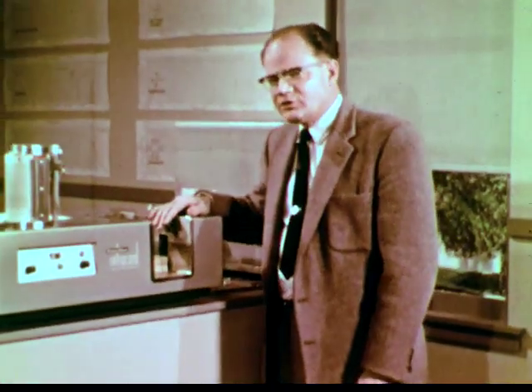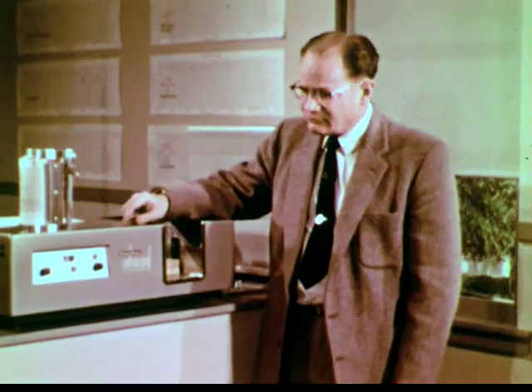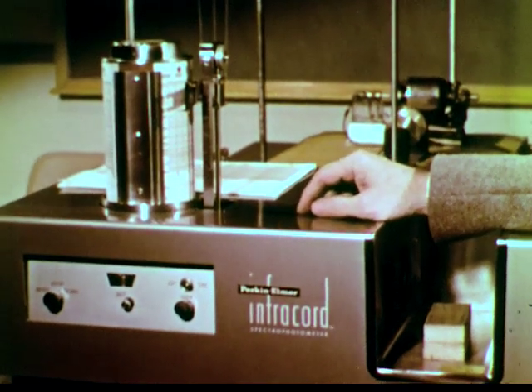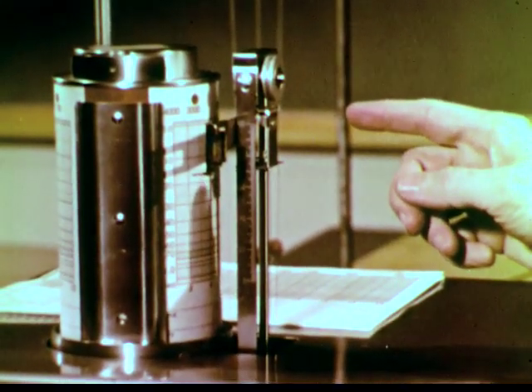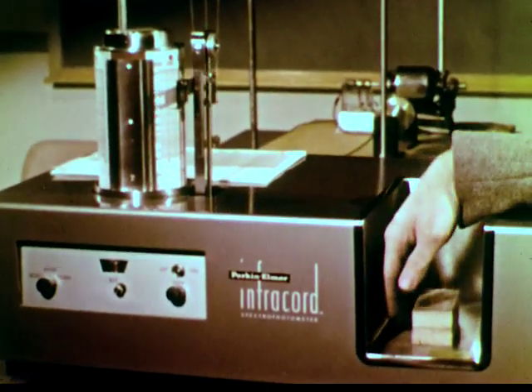Here, we have a spectrometer which scans the infrared spectrum and draws a graph of the transmission of the sample in the infrared. In this spectrometer, the instrument runs through frequencies in the infrared range, around 10 to the 13th cycles per second. The top of the chart corresponds to 100% transmission, the bottom to 0 transmission.